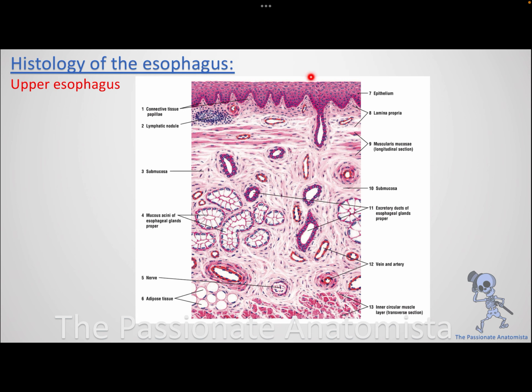Okay, these are the three of them. We call them the mucosa itself. All right, so these are the three layers of mucosa, and then followed by the submucosa, and in that you get to see the mucus glands. Again, we have them in the esophagus and the duodenum. You get to see the ducts, all right, to receive the secretions from these cells.